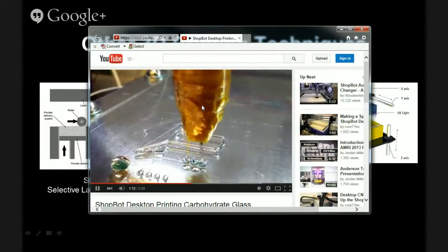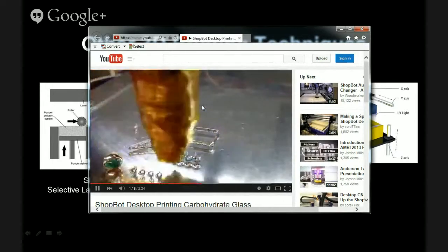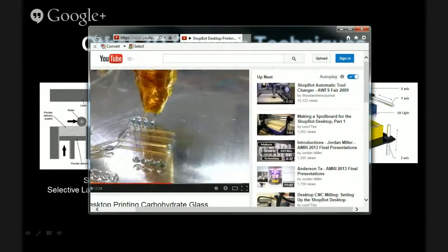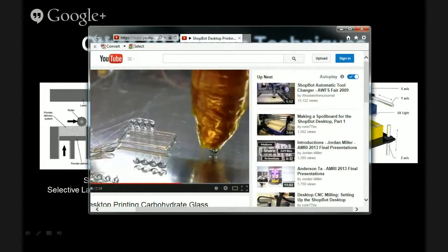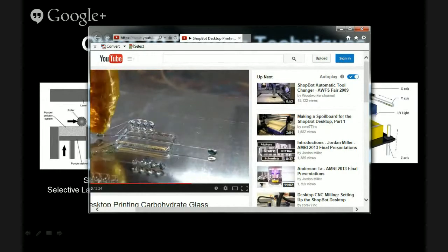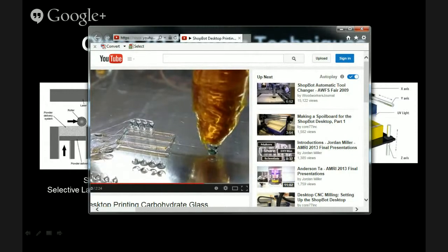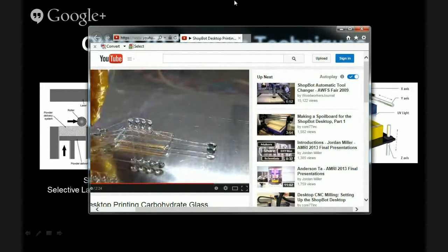Is this sucrose? What's he using? Is this cane sugar? I'm not sure exactly. They call it carbohydrate glass. Carbohydrate. I think originally they were drawing on a lot of the sugar glass recipes like used in Hollywood. It's like table sugar. I don't know if it's plain table sugar or not. That's structure there.